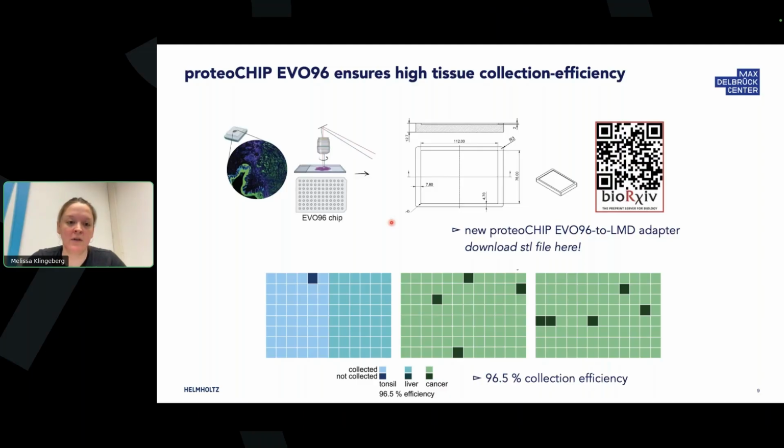And if you have an LMD in your lab, but you don't know how to collect into this chip, you can download the STL file here to print your own adapter for the lab.